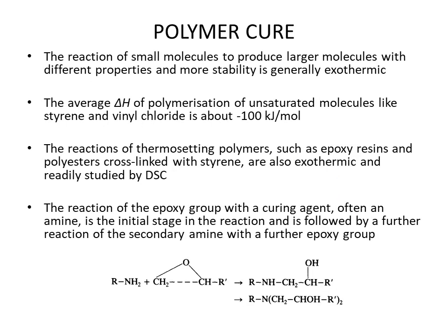Next application is the polymer cure. So curing is a process of toughening or hardening of a polymer material by cross-linking of polymer chains, which is brought about by electron beams, heat, or chemical additives.